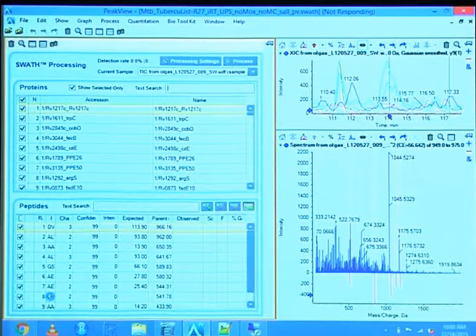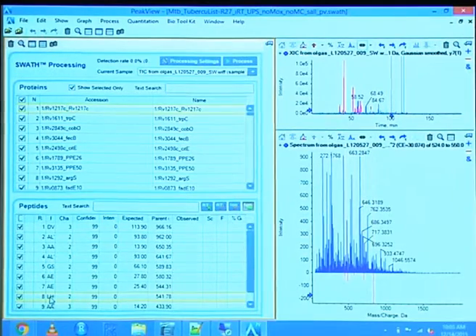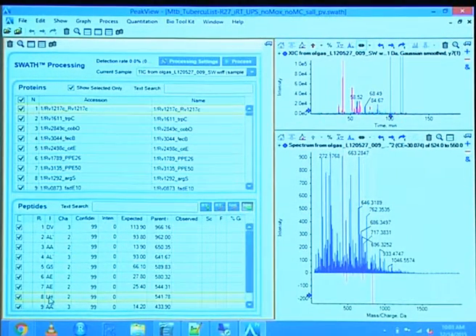But it still has the retention times in there, and as long as you do the normalization, and as long as it shifts all the expected retention times after normalization into positive space, above 0, it's fine. And you can also save it and open it, and that should work. But just initially, don't be surprised if something is empty and it suddenly extracts over the entire range. You see it. So in this particular data set, I've spiked in synthetic peptides.